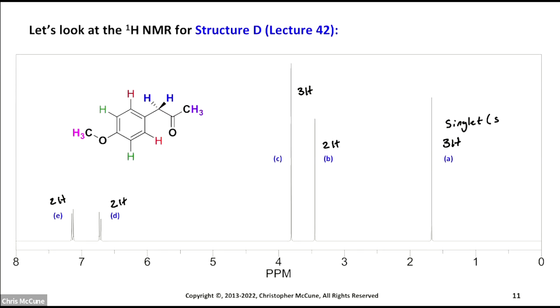So I'll just say S. Here's a singlet, S. Here's a singlet, S. Here's a doublet, although not perfect peak height ratio. It's because they're leaning. They're called leaning doublets, but still doublet. It's 2 peaks that you see. So it gets the abbreviation of D. And so that'll be a doublet there.